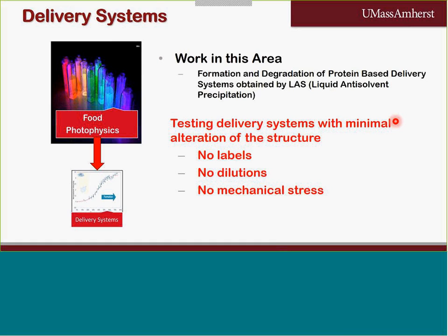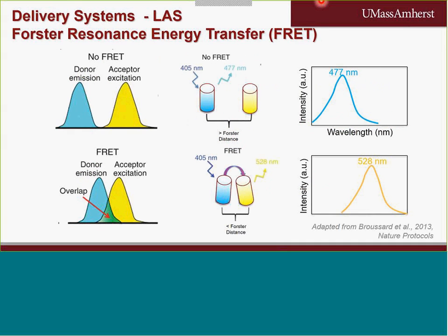In the case of Förster resonance energy transfer, or FRET, you have a donor, a probe that basically excites when it is exposed to a particular light source, and an acceptor, which is another probe that can also emit when exposed to a higher wavelength.